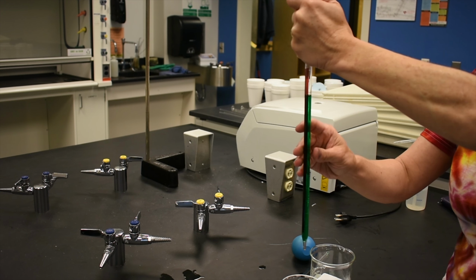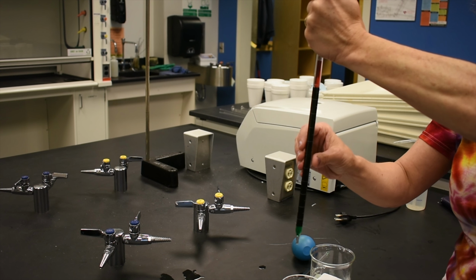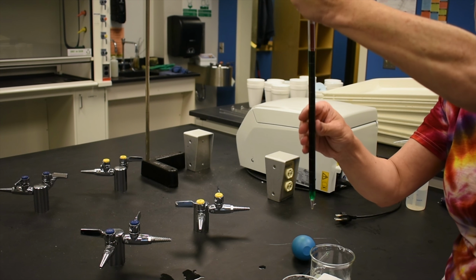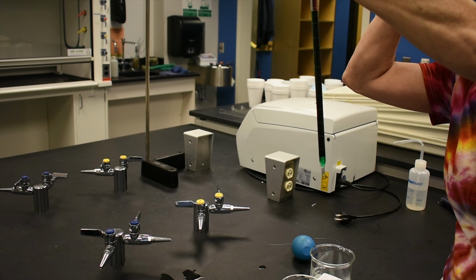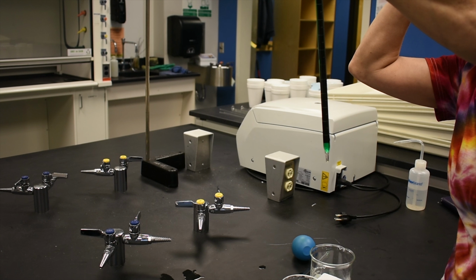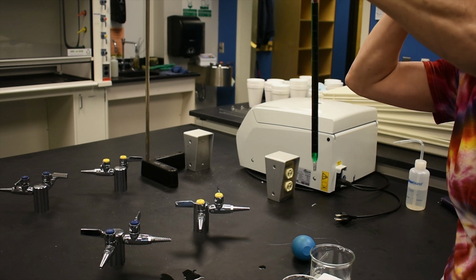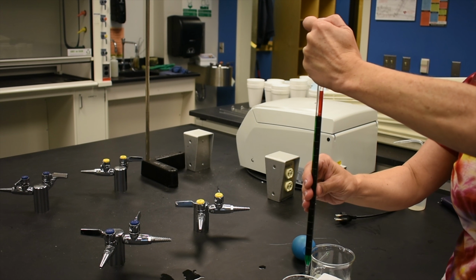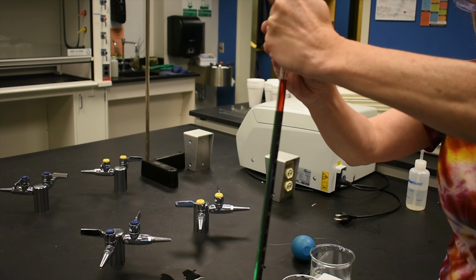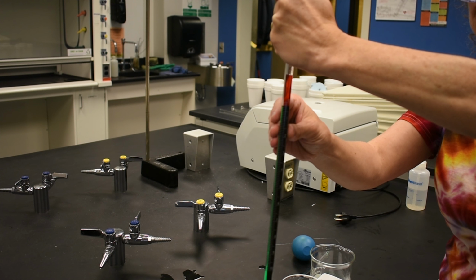If I'm a little bit below the 0 line and I want to know how much solution is in my pipette, I need to read the pipette backwards. So if I look at this, it looks like I have 9.7 mils in my pipette. And I'll turn this around. I'm not sure if you can see this very well, but it should be about 9.7 mils that are in here.